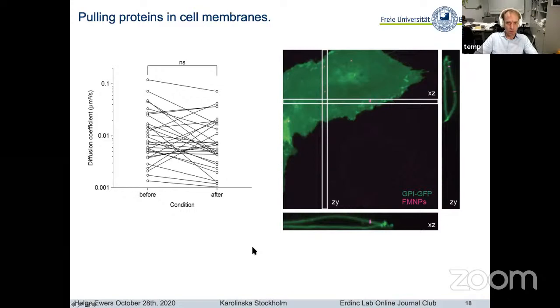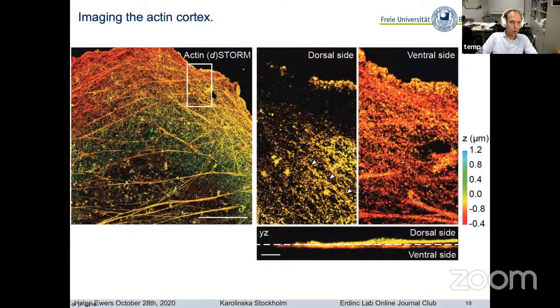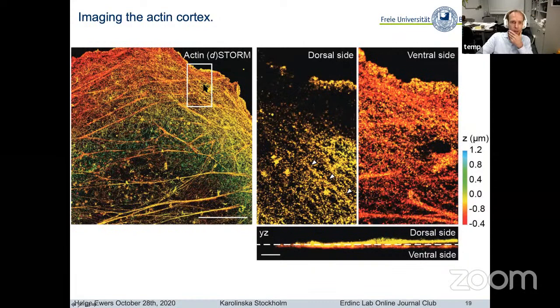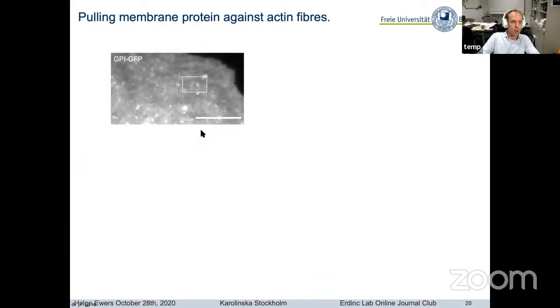Our aim is now to correlate the motion of these particles to obstacles inside the cell membrane. To do so, we perform STORM imaging of the actin cortex. We have a 3D-capable STORM microscope, so we can distinguish the dorsal sides of the back of the cell from the ventral side. Here you can see ventral actin cables, and then the dorsal filaments. You can see this is dorsal and this is ventral actin. And of course, when we look at molecules that bind to the top surface of the cell, we want to correlate motion to these dorsal actin fibers.